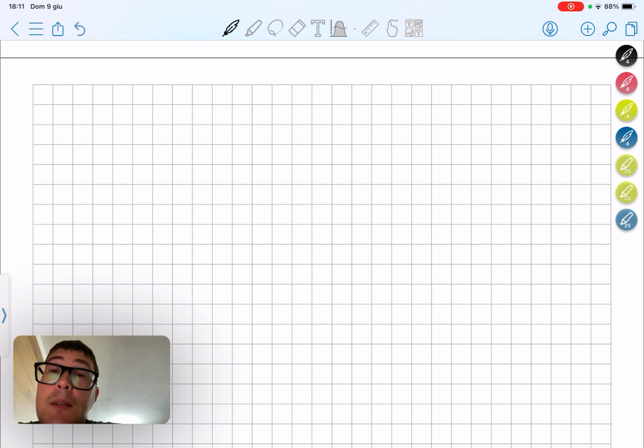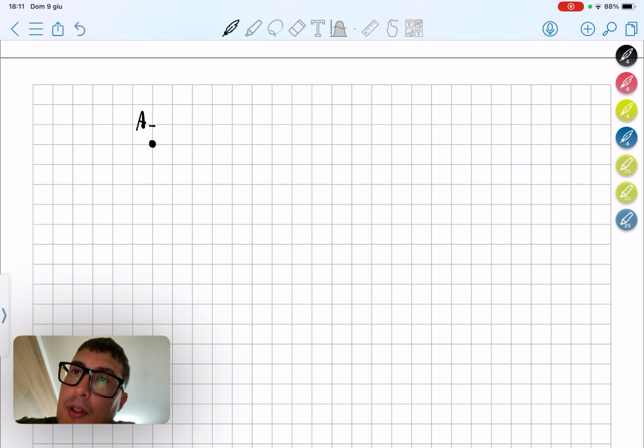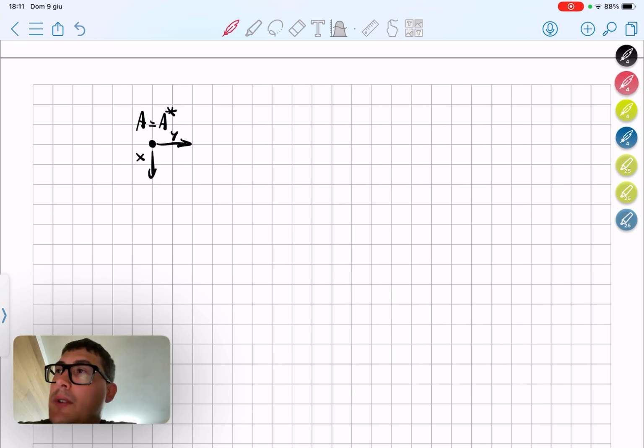From that point onward, say the cantilever arrives here and measures a certain amplitude. It stops where the amplitude is equal to the fixed amplitude that we decided, and then it moves in the x or y direction to the next point, where probably there is a change in the amplitude because of the topography of the sample.